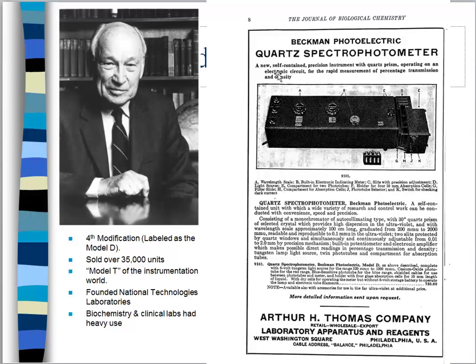It says a new self-contained precision instrument with quartz prism operating on an electronic circuit for the rapid measurement of percentage transmission and density. Okay, so this quartz is going to be important. We're going to mention this a little bit later on, so remember that.